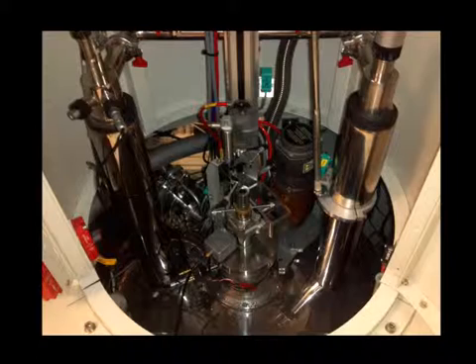So this is currently in a non-operational state. You see this dissolution stick is over to the side. It rests on this spring-loaded collar here so that you can get access to the VTI. So this is ready to load the sample in here.